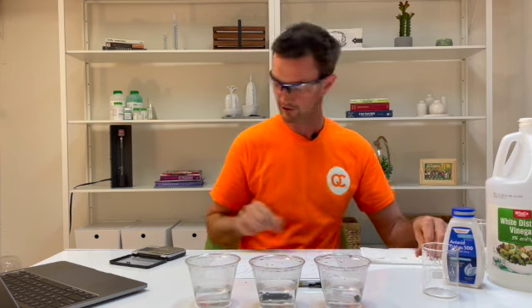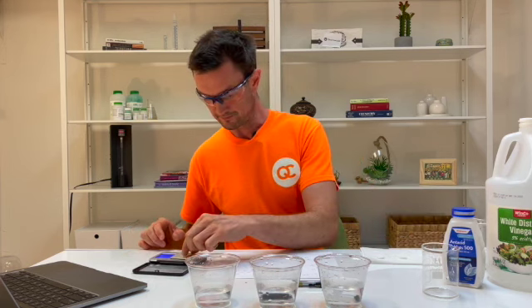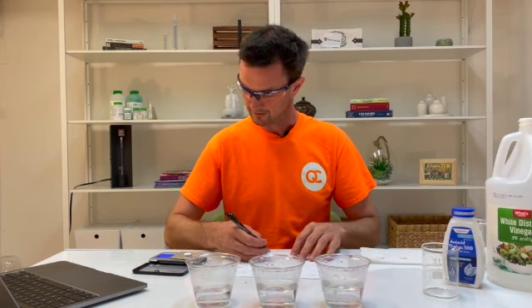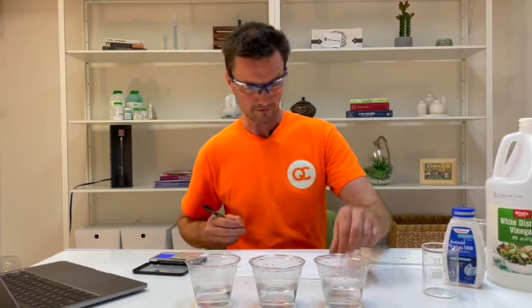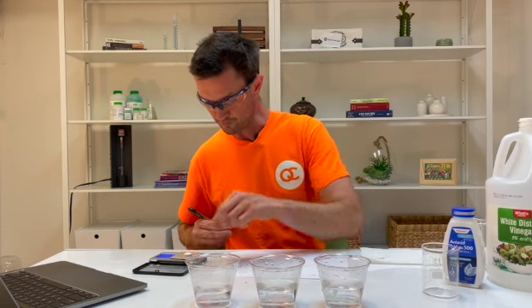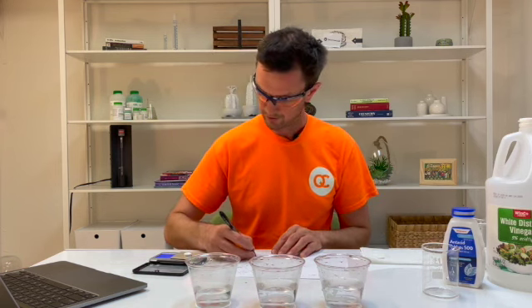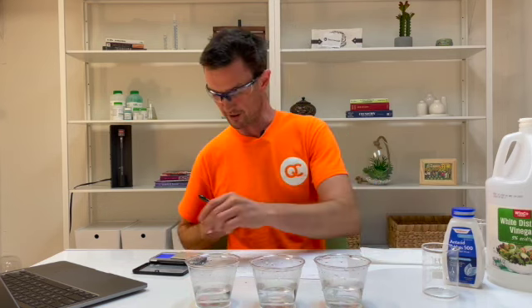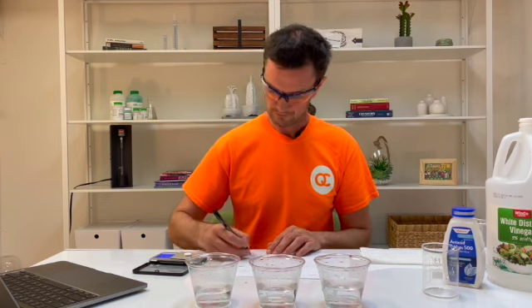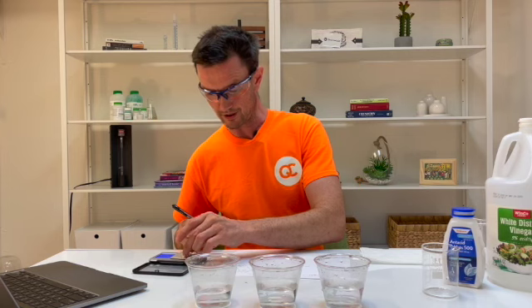Okay, now step 2 is I'm going to weigh 3 Tums individually, record their mass. So I have 3 Tums right here. So I'm going to turn my mass balance on. Tum number 1 is 1.30. I'm going to put that next to this cup. Tum number 2 is 1.28. Tum number 3, 1.31.